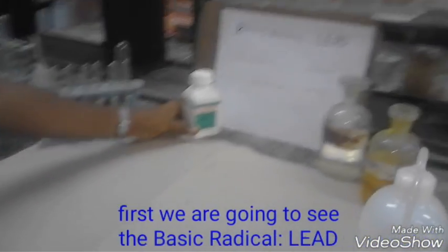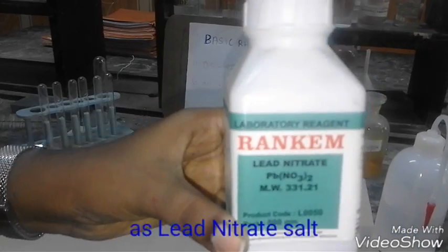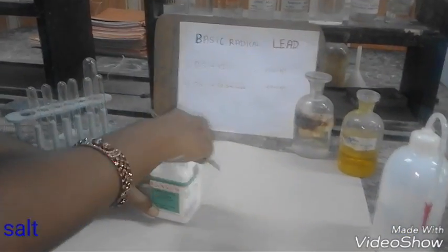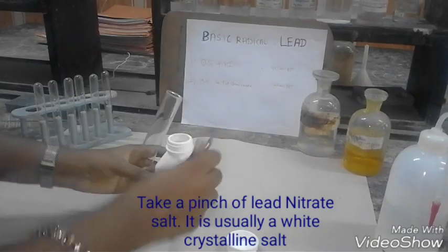Now we are going to see the confirmatory test for basic radical using the salt lead nitrate. It is usually white crystalline in nature. Here the given basic radical is lead.